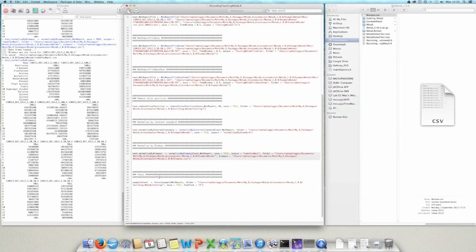Generally, at the end of the experiment, we want to identify metabolites that are present at significantly different levels across experimental conditions. For this reason, we have a function in Metab called htest, which is able to perform two types of analysis, a t-test or ANOVA. Very simple.